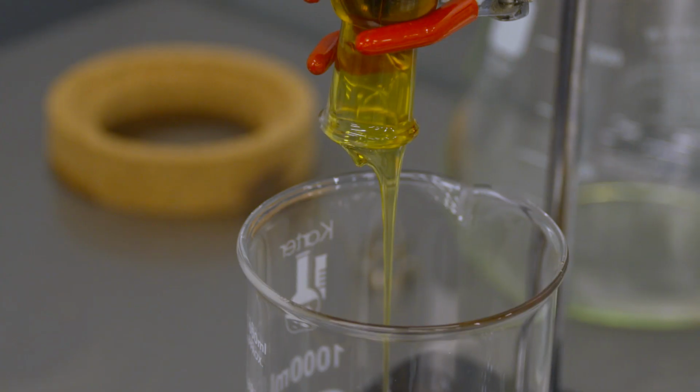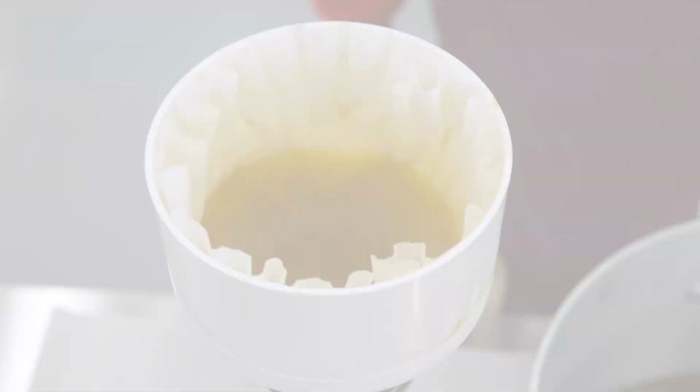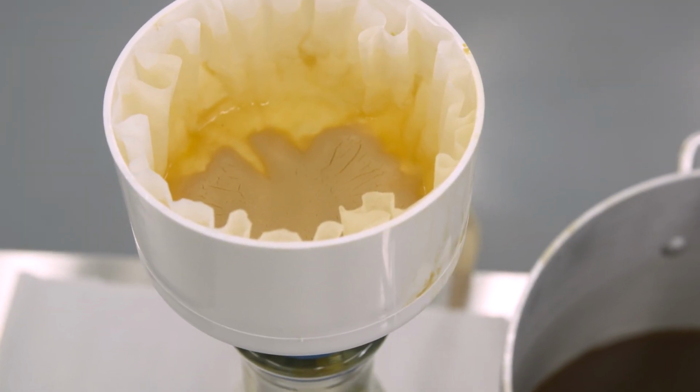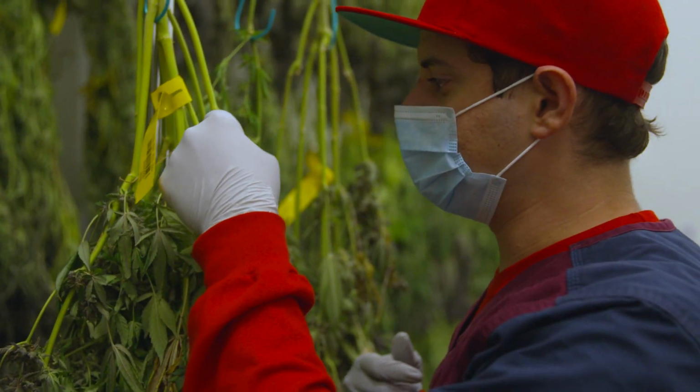We use rotary evaporators as a method of solvent recovery post the winterization process in our refinement methods for producing what are known as absolute oils that can be used for infusion of basically any different type of medical cannabis product. Winterization is the process by which fats and waxes are removed from an extract that contains them. So when plants are extracted, the medicine is inside a waxy envelope called a trichome, and some extraction methods dissolve not only the contents of the trichome but the trichome itself.